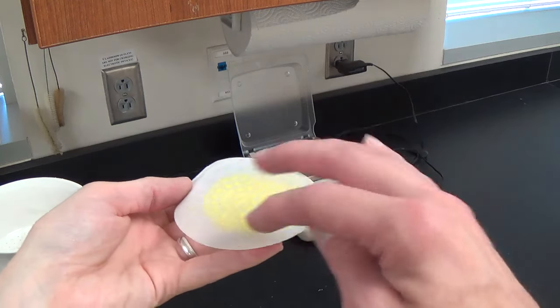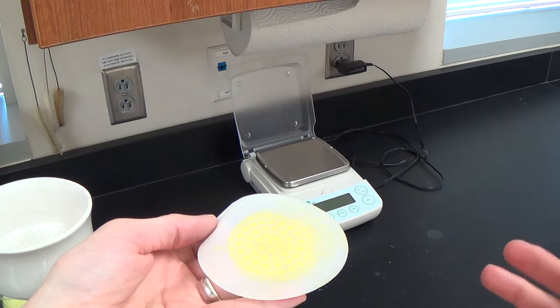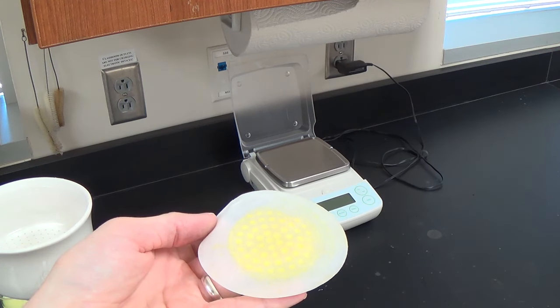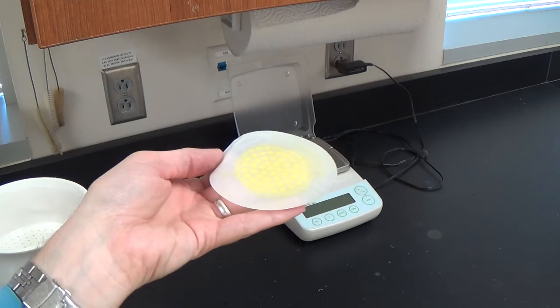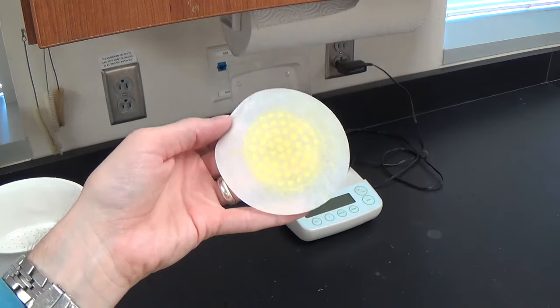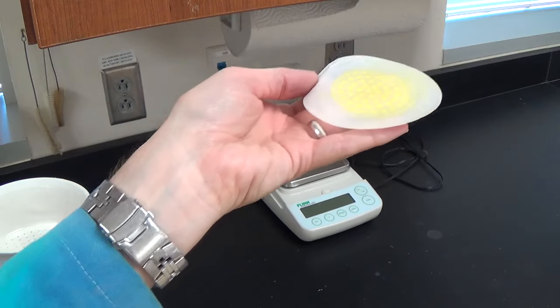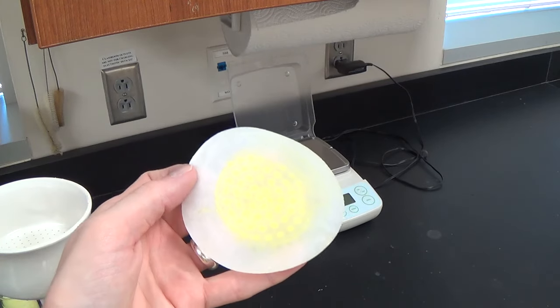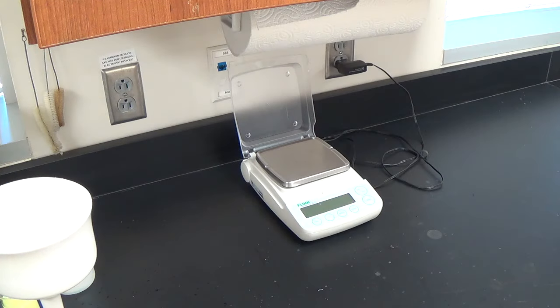Let it dry overnight. By tomorrow it will be dry. Does that possibly give time for contaminants to get onto our filter paper or for some of this to blow away? Yes, but we're going to assume that that is a negligible amount of change. Although if you're putting it under an air conditioner vent or a place like that, it might be a noticeable amount, so you want to pick your location carefully. Our windowsill should be nice and calm for it to sit there and dry. Once it is dried in the windowsill, then you take your final mass measurement, and then this can just simply be thrown away, and you're ready then to calculate the mass of your solid.